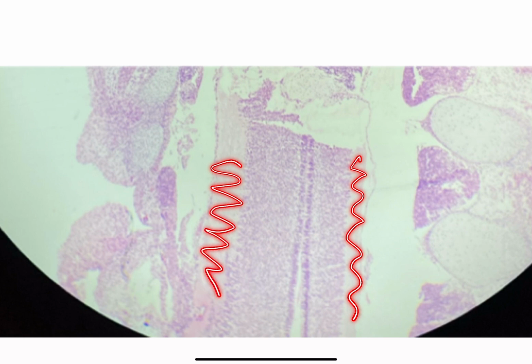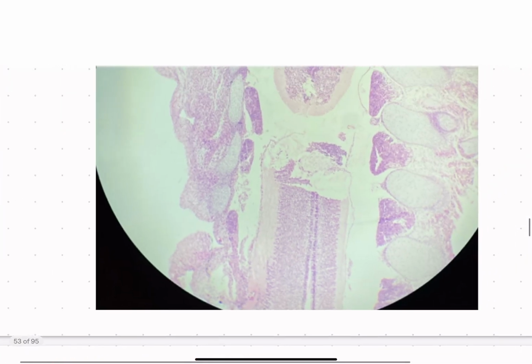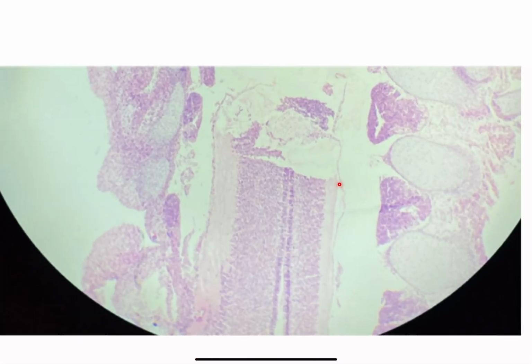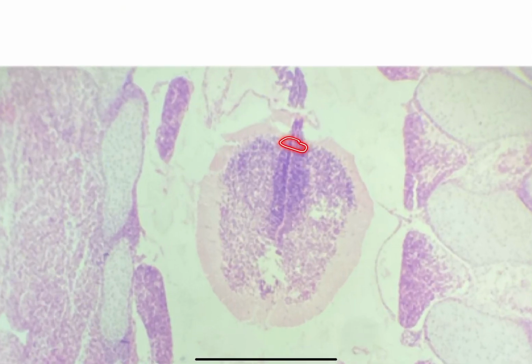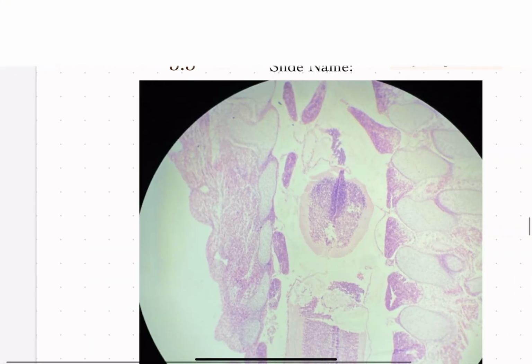You can imagine the term within the margins, which is just the margins of a paper. So the corners of a paper, that would be the outer end. While here we have it in cross section. So we have the ventricular zone here, a lot darker, the mantle zone here, and the marginal zone, as well as the pia mater could also be something that they ask you about.